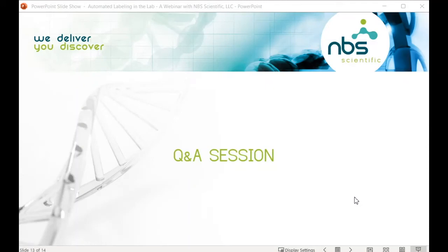The other option is there is a VX2 short unit. So it's shorter than the original VX2. The dimensions of this VX2 here are 33 inches tall, 27 inches wide, and 14 inches deep. And we can show you that real quick. Sammy, could we go back to the webcam for a second? Yes, 1 second.